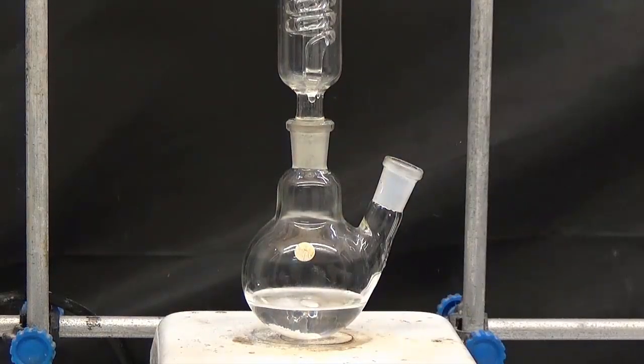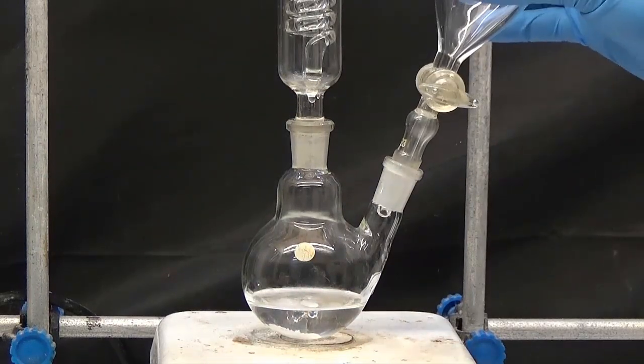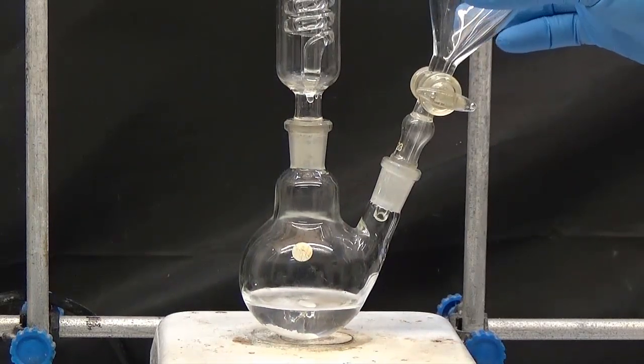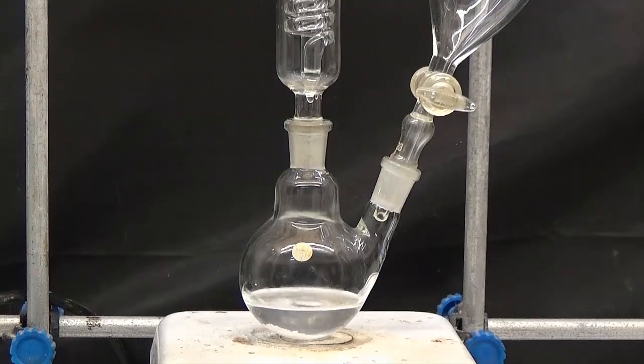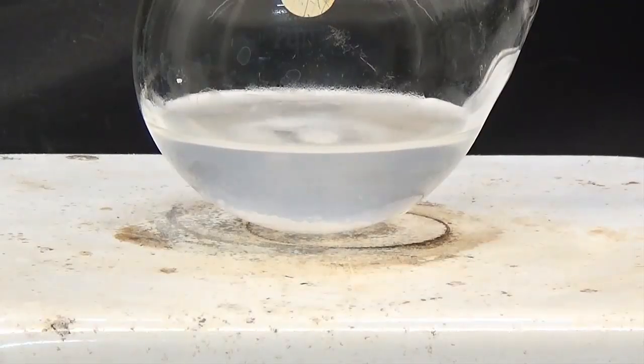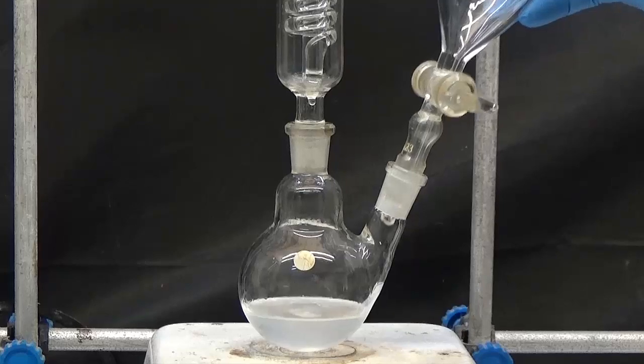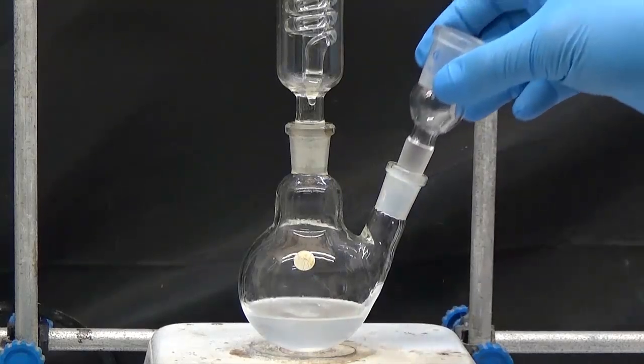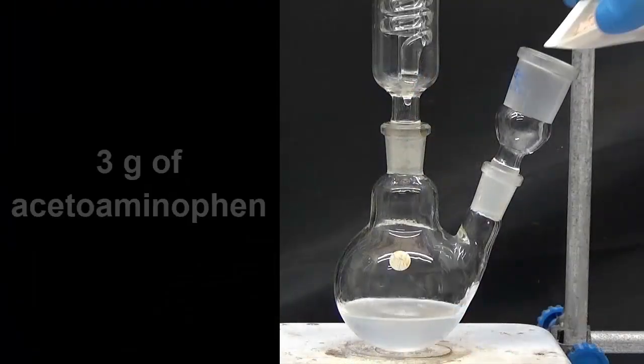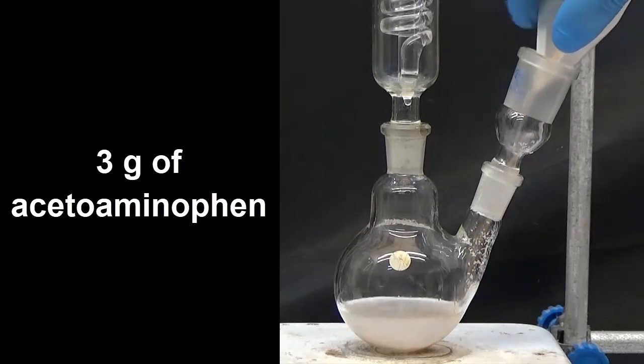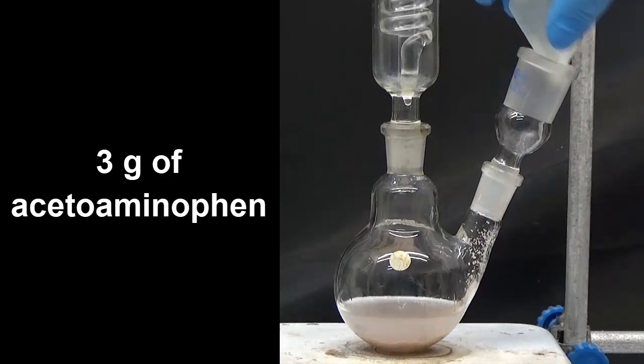We put an addition funnel on it. Warm with reflux until the sodium hydroxide dissolves. Once the dissolution is complete, add 3 grams of acetaminophen and heat for 15 minutes under reflux.